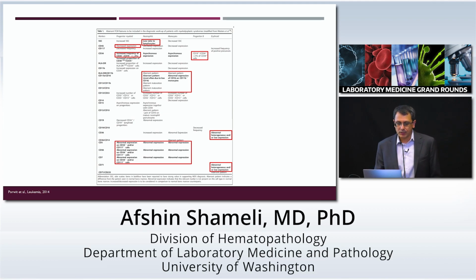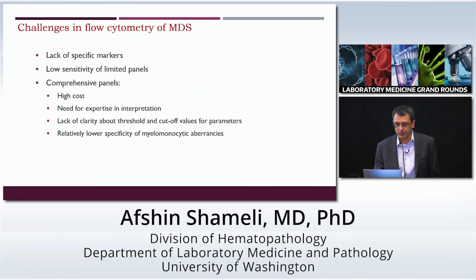But as you can see, the application of this panel requires multiple tubes with several antibodies, which is costly. In addition, interpretation of these results requires a lot of time from the pathologist side.